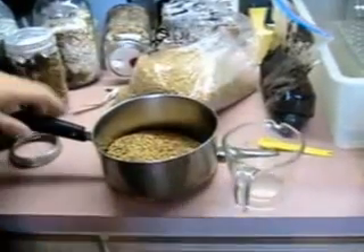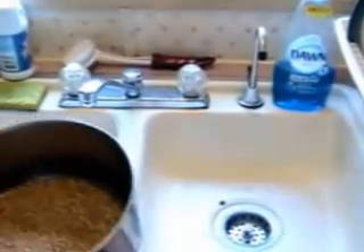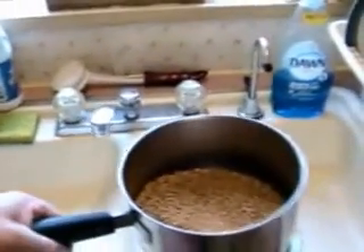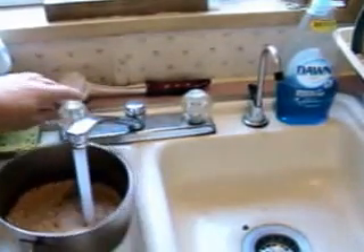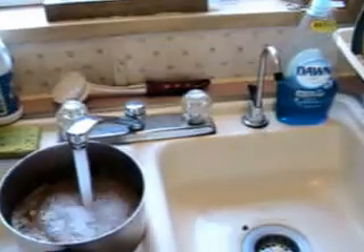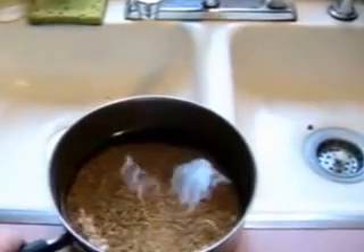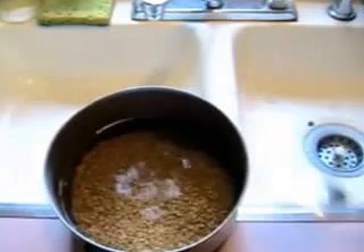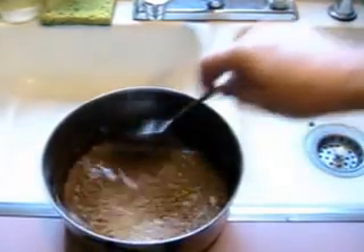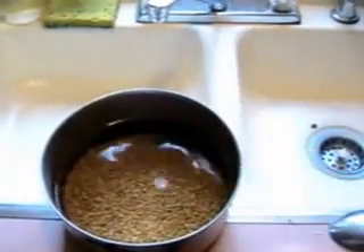The first thing you're going to want to do with that grain is rinse it. This is food grade triple cleaned wheat, so this isn't going to be very dirty. But if you're getting feed grade grain, this is really a necessity. Just run water in it and stir it a little bit. If this was feed grade or seed grade grain that hasn't been triple cleaned already, there would be a lot of floaties and extra stuff in it.